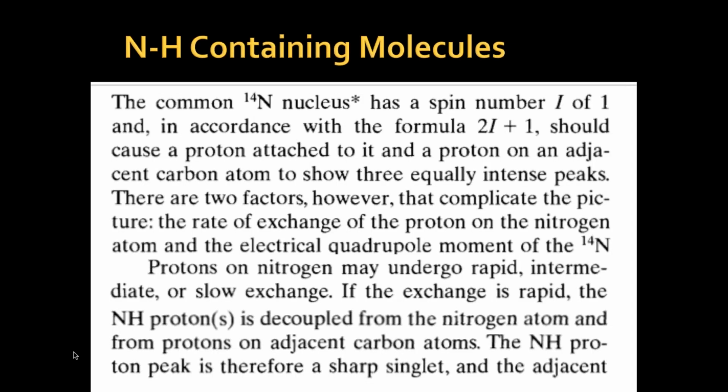Quadrupole moment generally shows up in nitrogen. The nitrogen atom and hydrogen, as I said, have rapid exchange between them, and they have their own magnetic behavior.